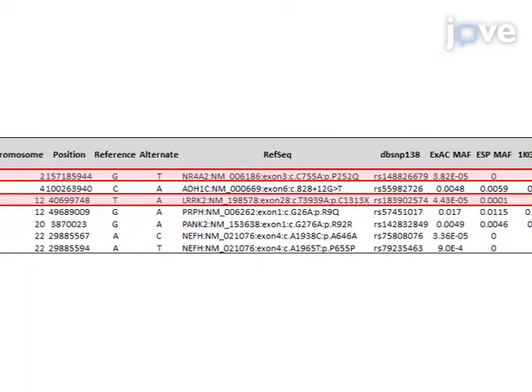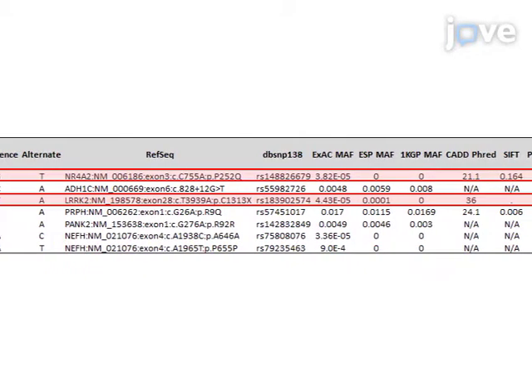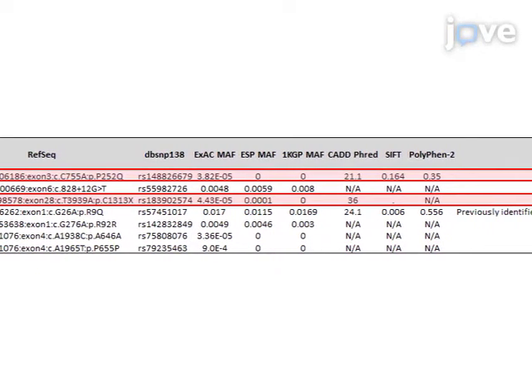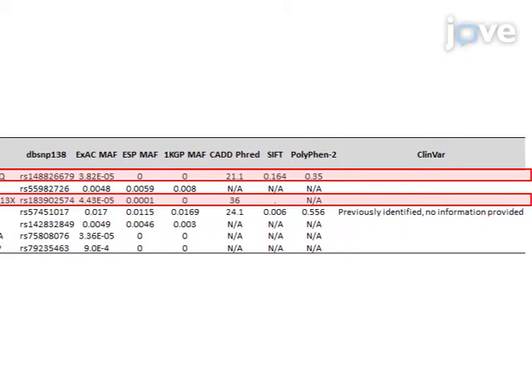To demonstrate the utility of this targeted NGS workflow, the example of a 68-year-old male Parkinson's disease patient is presented, showing a reduced ANNOVAR output. Annotated variants are curated to identify those that are most likely to be of clinical significance, as denoted by the red boxes.